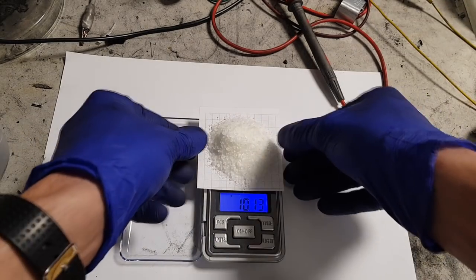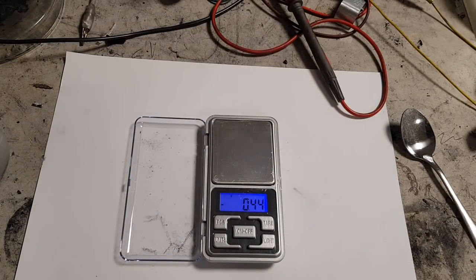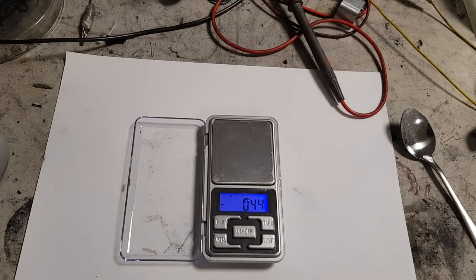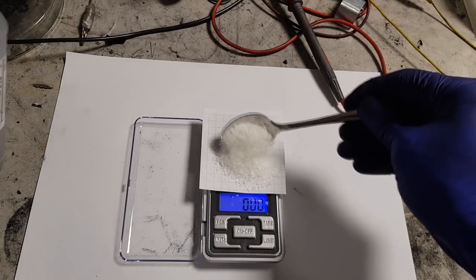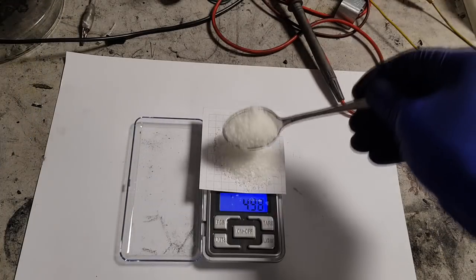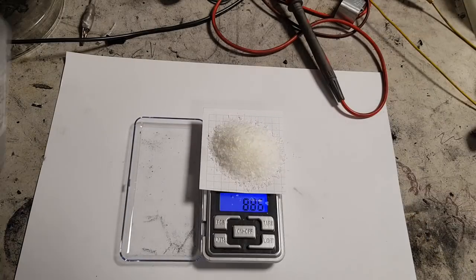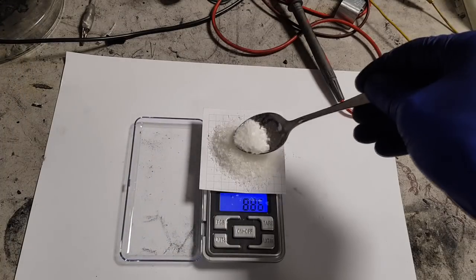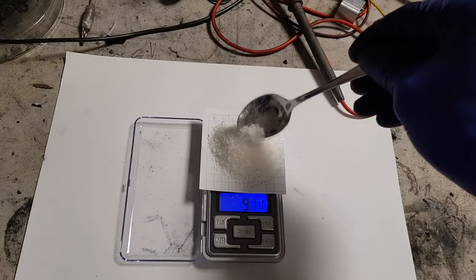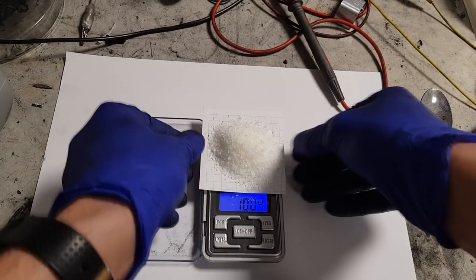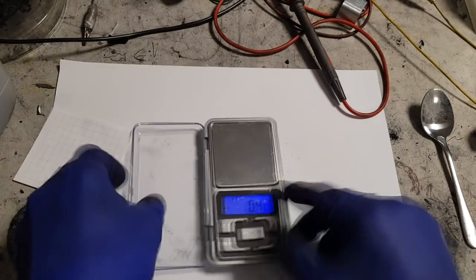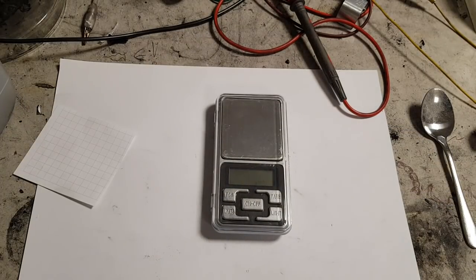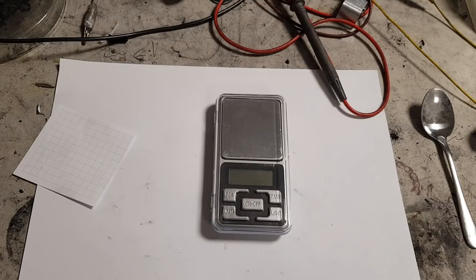I will add two times 10 grams of PVA. And another 10 grams. So, like I said, you add 10 grams of potassium hydroxide and 20 grams of PVA into 300 milliliters of water.